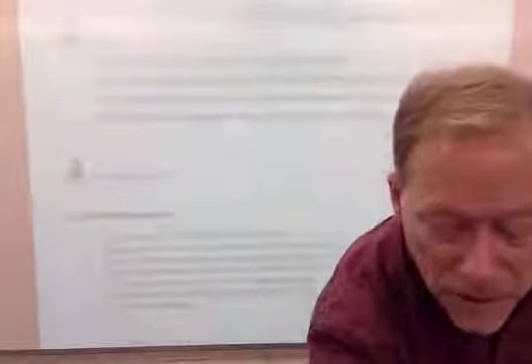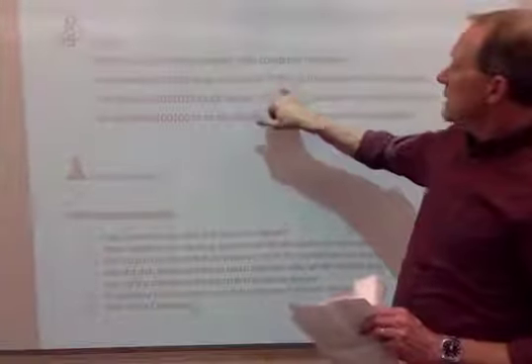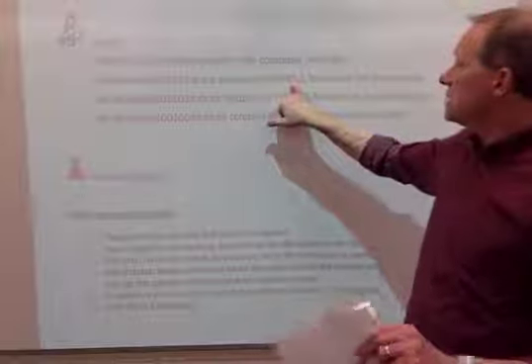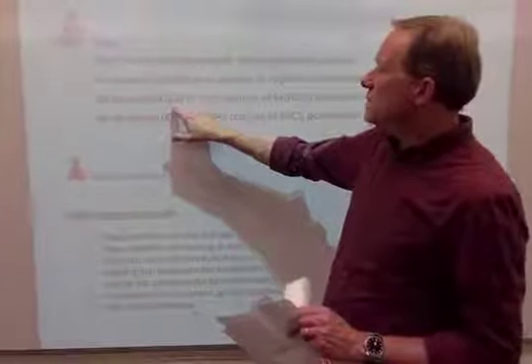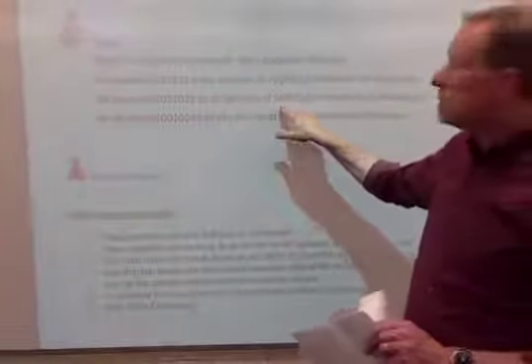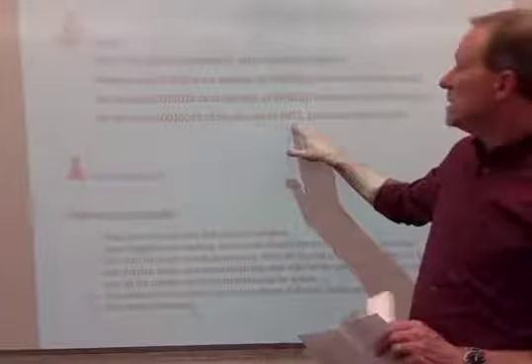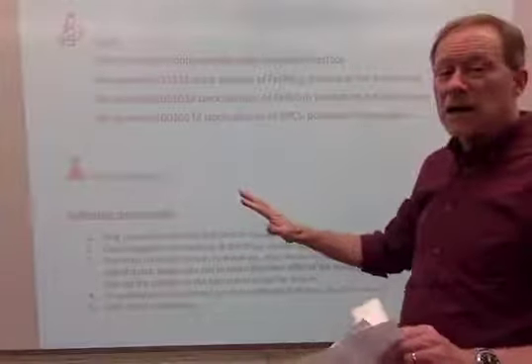Let me scroll down on the page a little bit here, if you follow along, and we can look at some of the solutions that we're going to deal with in this lab. So we have one iron 3 ion, with the nitrate ion, so it's completely dissolved and dissociated in solution. And that's at the highest of these three concentrations. It's 4 times more concentrated than this second iron 3 solution, and it's 80 times more concentrated than the thiocyanate solution. It also has a spectator ion of potassium. So nitrate and potassium are spectator ions in this equation.